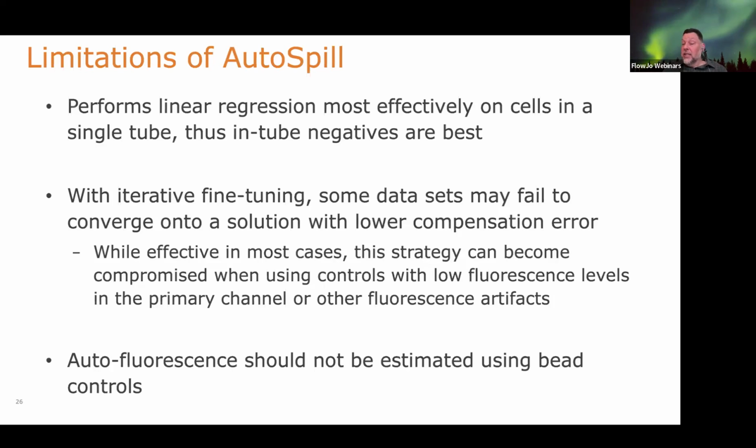Thank you, Ariana. And that's exactly what I said. If it's PE, use a different marker that has a nice positive signal, no problem. PE is the same no matter where you get it. FITC is the same no matter where you get it. But if it's any tandem dye, you have to work out a different way to get it. And that's what I revert back to.